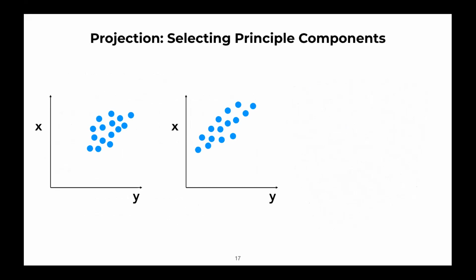So in PCA, we were talking about the variance. Here in the first graph, you can see it has low variance, right? In the second graph, you can see it has high variance. So why low variance? Because the data points are close together, and so that shows low variability. Here the data is more spread out, which shows high variability.